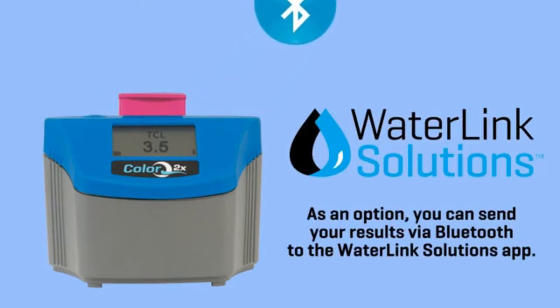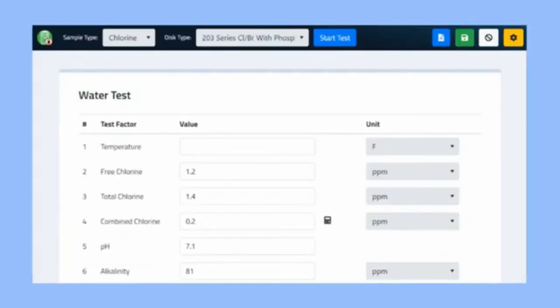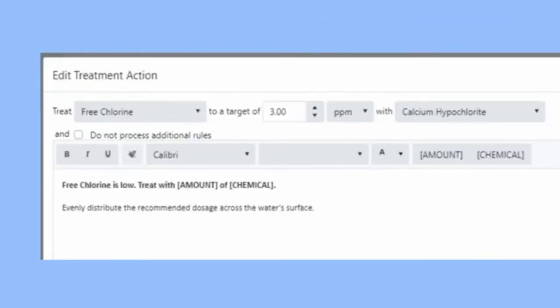As an option, you can send your results via Bluetooth to the WaterLink Solutions app. Manage records, store and transfer test results, build treatment recommendations, and more.